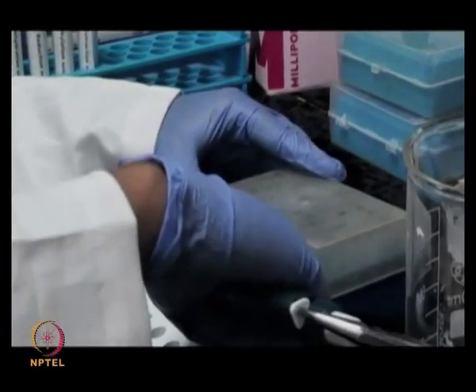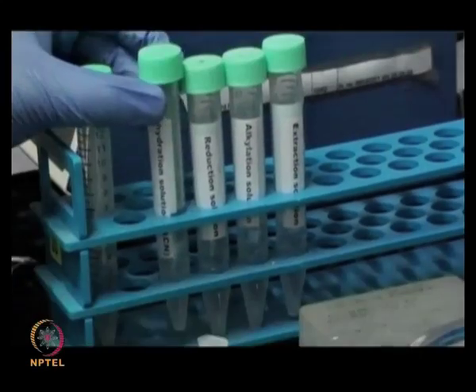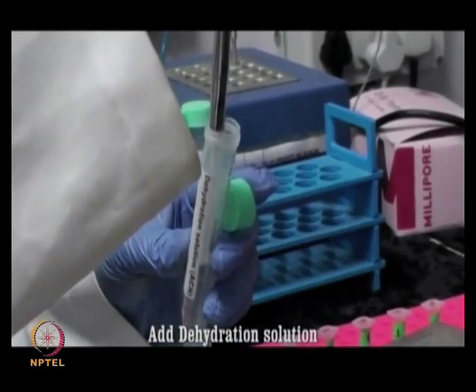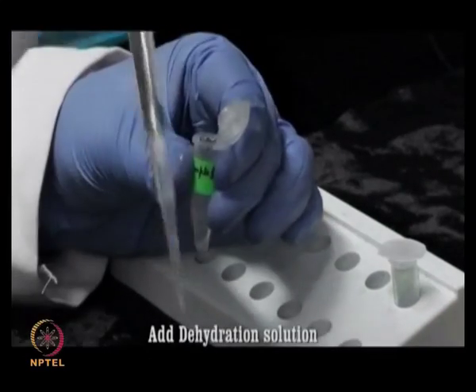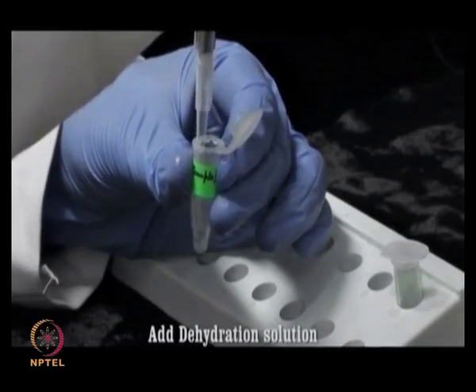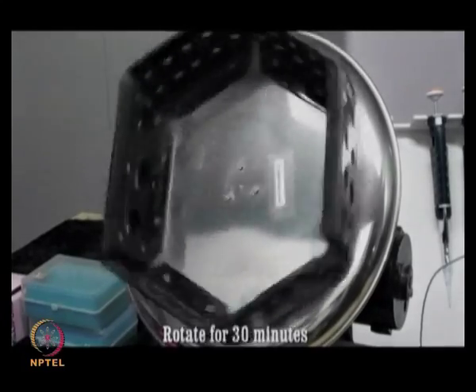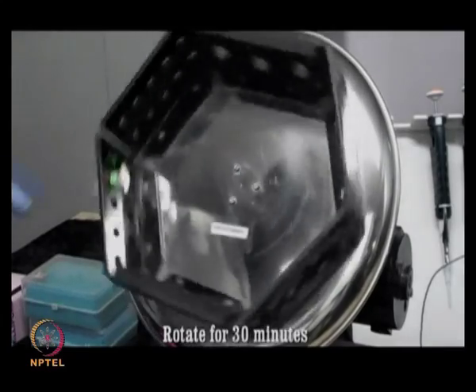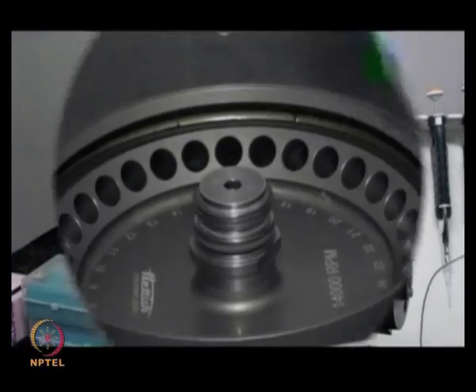So, you have seen the animation. Now, once the staining is removed, you can add dehydration solution. Add 50 to 100 microliter of dehydration solution and rotate that at room temperature. You need to ensure that you change the solutions after every 10 minutes, so that gel pieces become white and stick together.